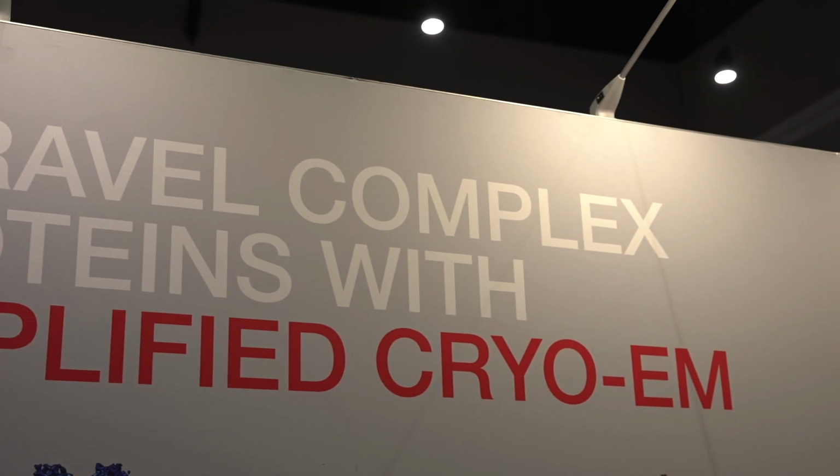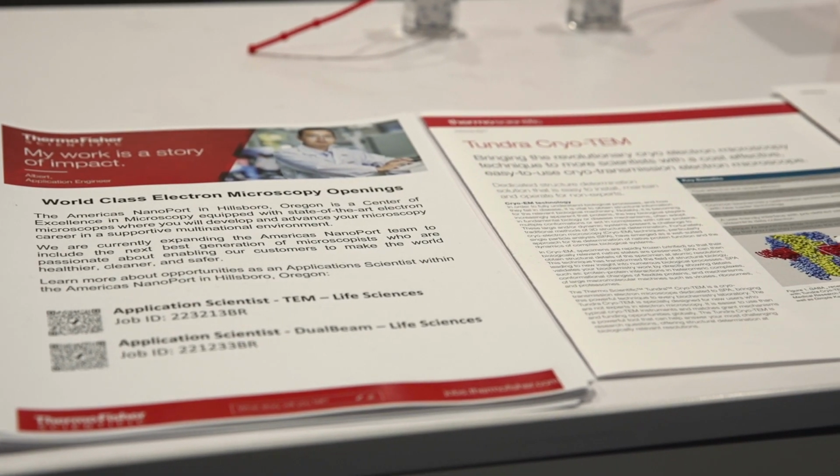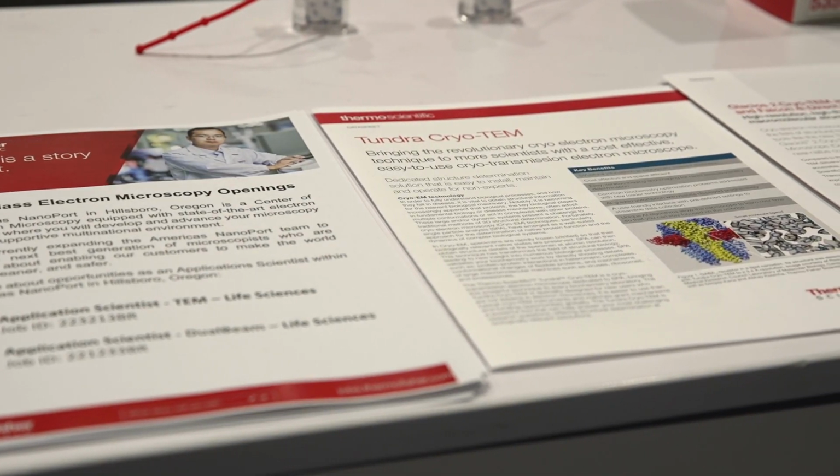BPS for me has always been the why, right? It's just the biology questions that people are approaching and asking, and I think that's where the amazing science is happening. And so you get to talk to people about their problems, about their projects, about their work, and really think about how we at Thermo Fisher can actually help them and enable structural biology for the protein biochemist and the biophysicist, and that's everybody that's in this room.